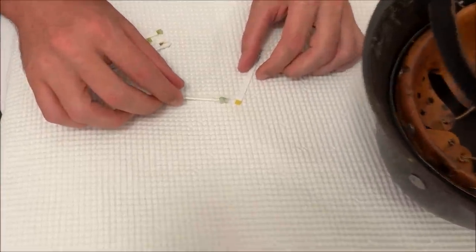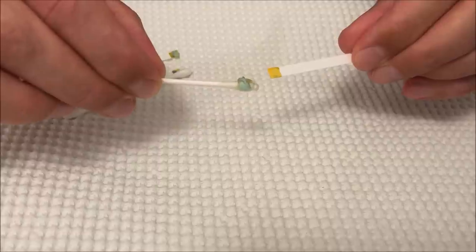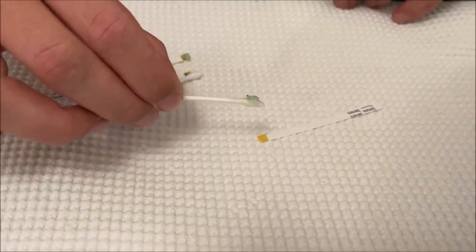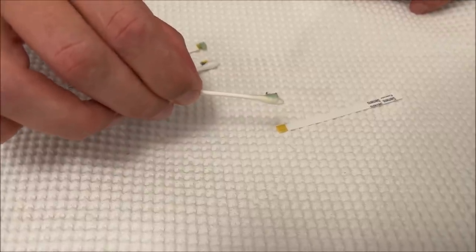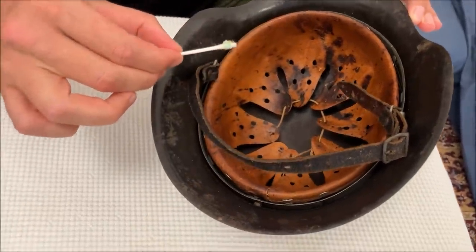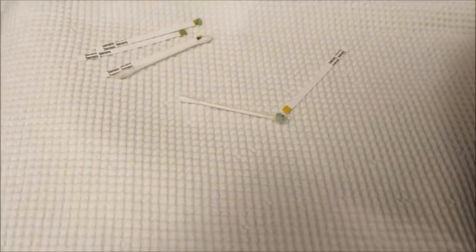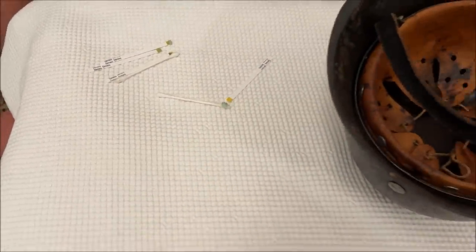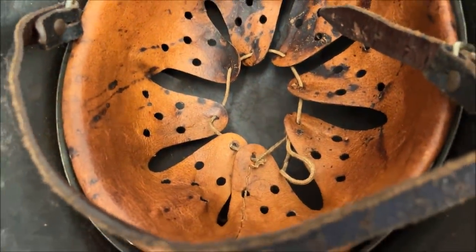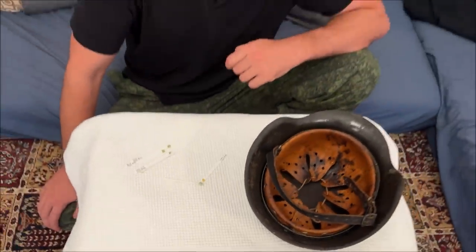A few minutes later — the q-tip and test I used to rub the helmet: the test remains yellow with a very slight greenish tint, but the q-tip itself became quite frankly green. So apparently the test is positive after all, just took a few minutes. It's only slightly positive because only a very small quantity of hemoglobin came off the inside of the helmet. I would conclude that this proves there is some hemoglobin in this helmet, and considering its history we can reasonably say it's probably human blood — which doesn't mean all the rest of the story is true, but it certainly gives it some credence.